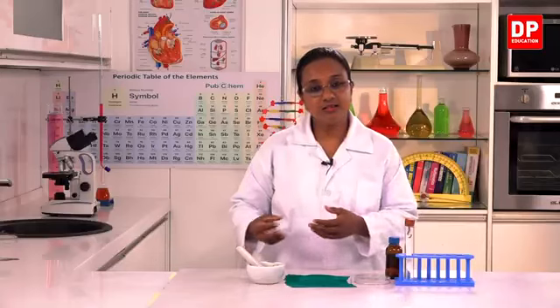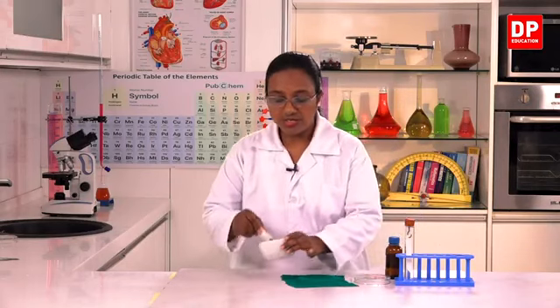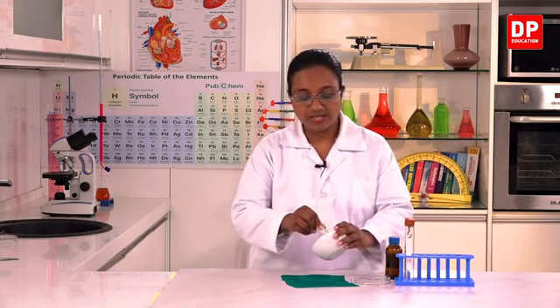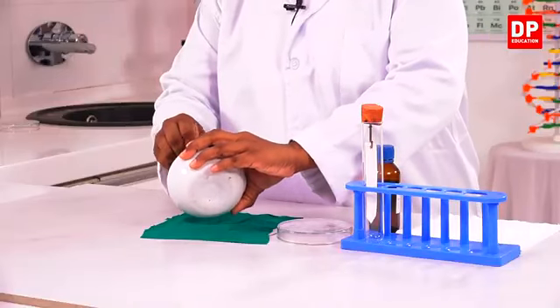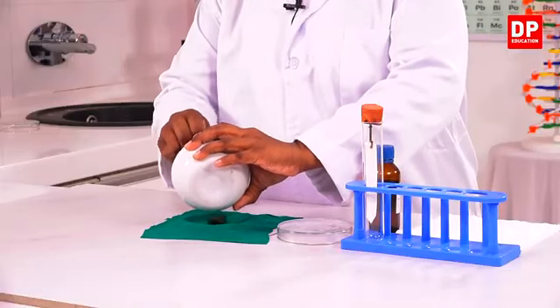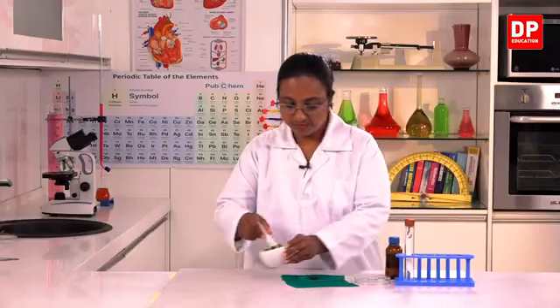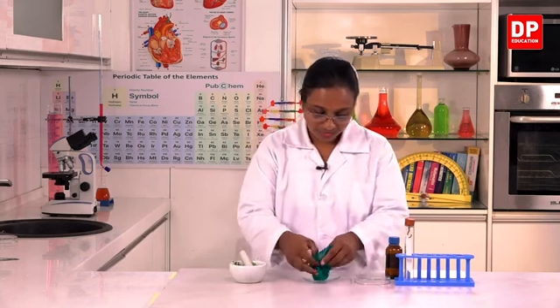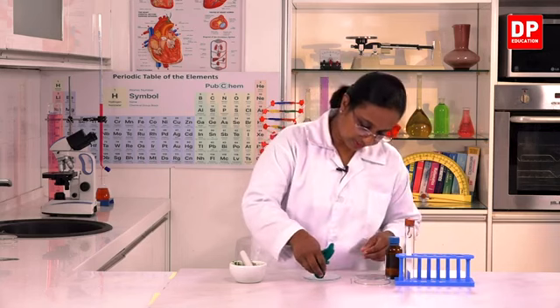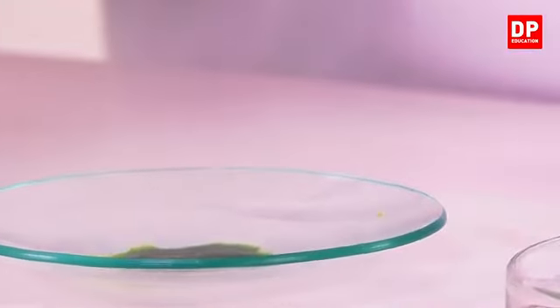To get the juice from the leaves, I have to filter it using a cloth. What I have already ground into a paste-like mixture, the pulp, I will transfer onto this cloth and get the extract from it. So here I have the ground leaves. If we take the extract from it, you can see it is a nice green color extract.